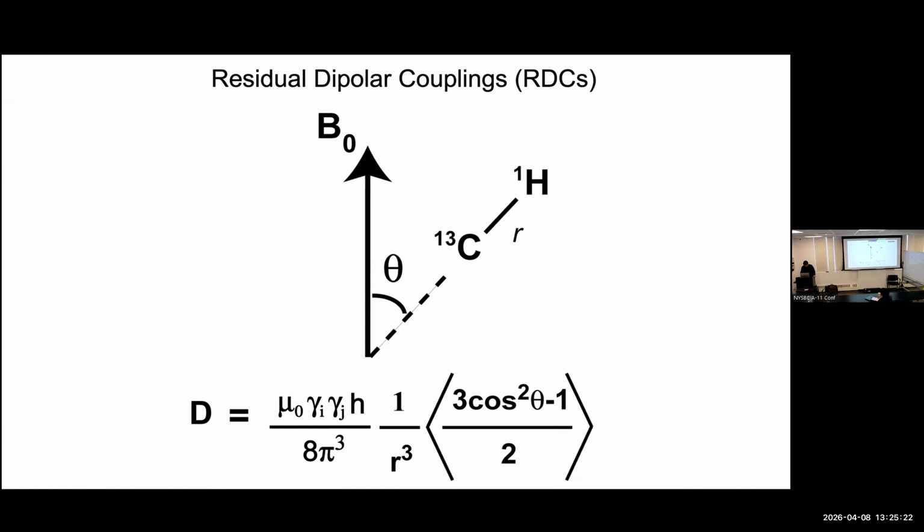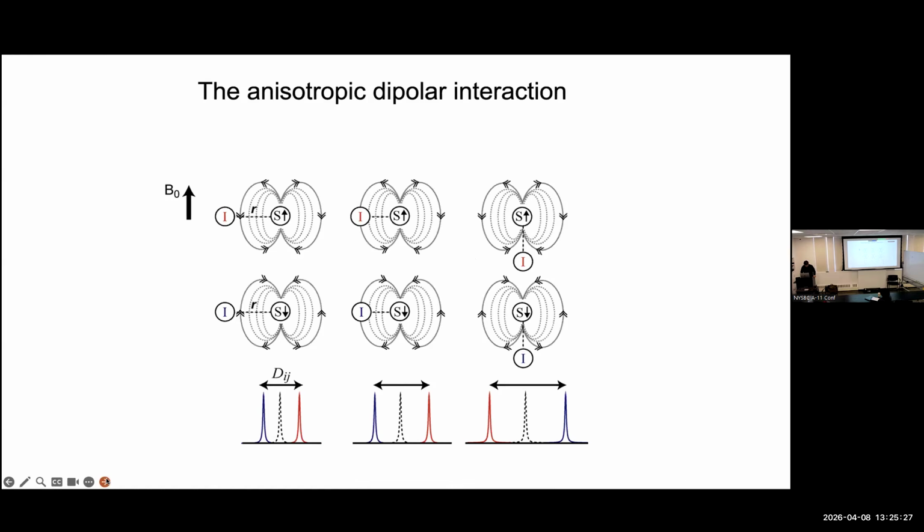Okay, so in terms of the physical nature, you might wonder how I build a physical understanding of the dipolar interaction. It really is no different than the interaction of magnets. So, for example, here I have a spin I.